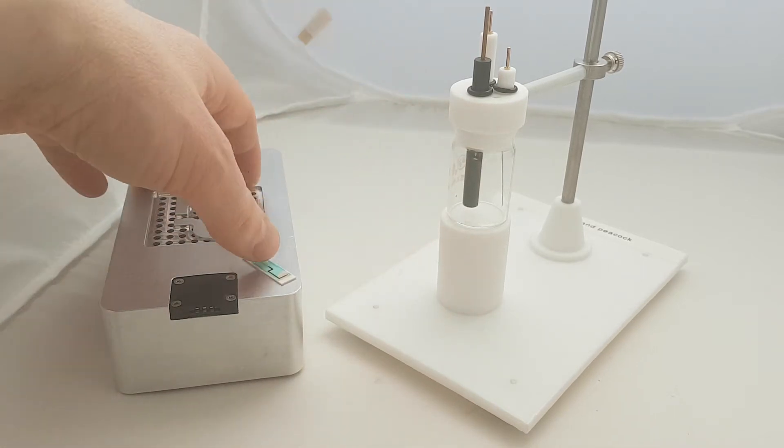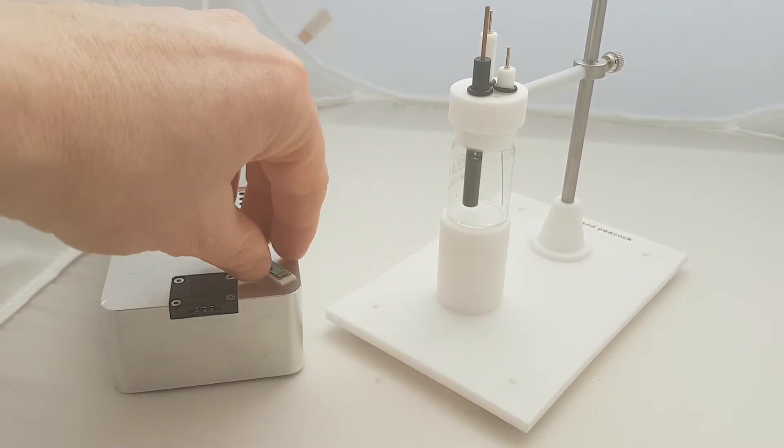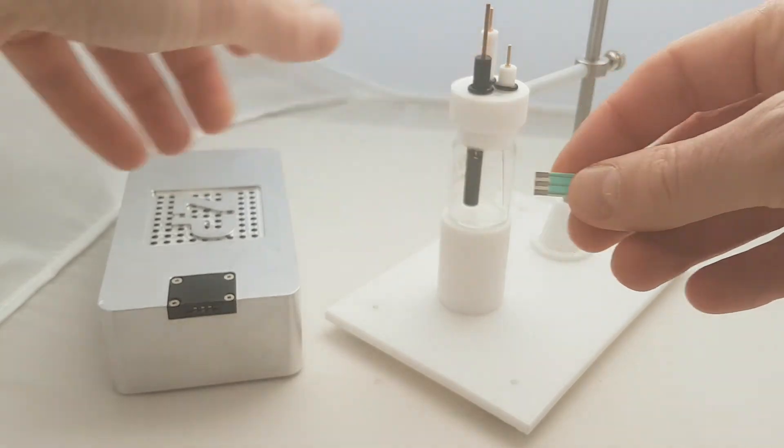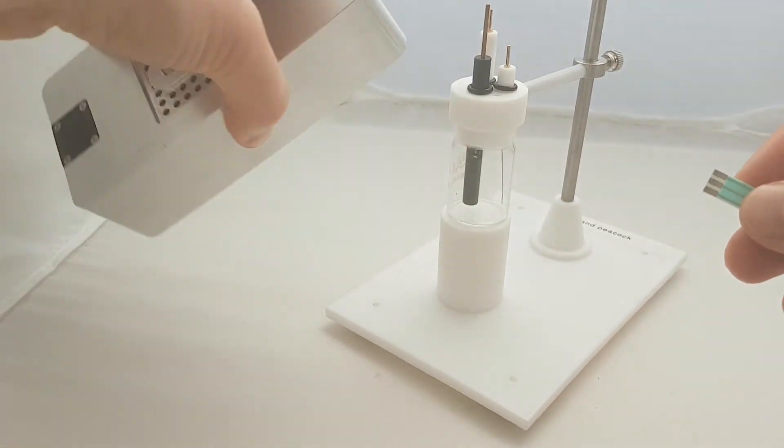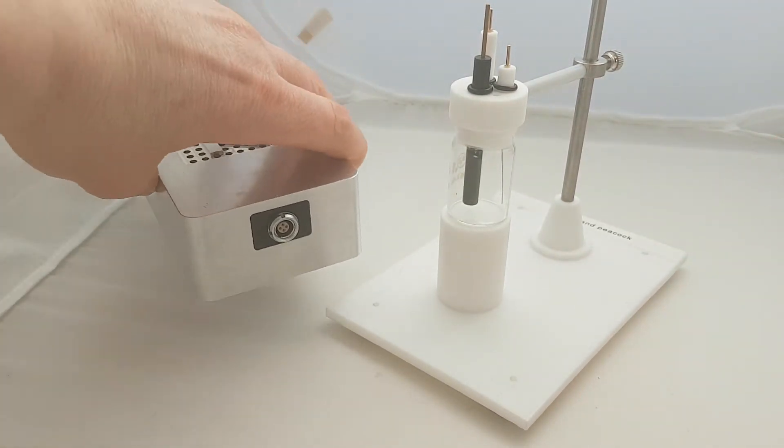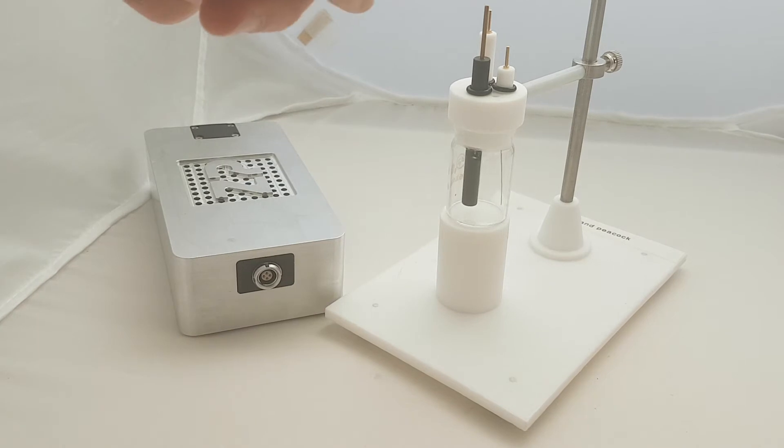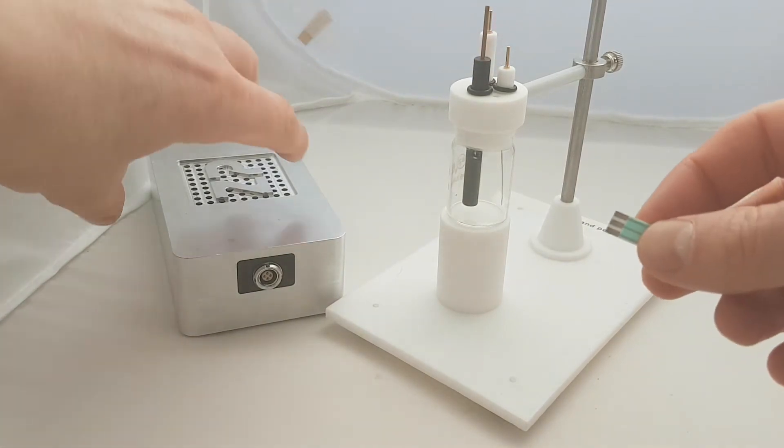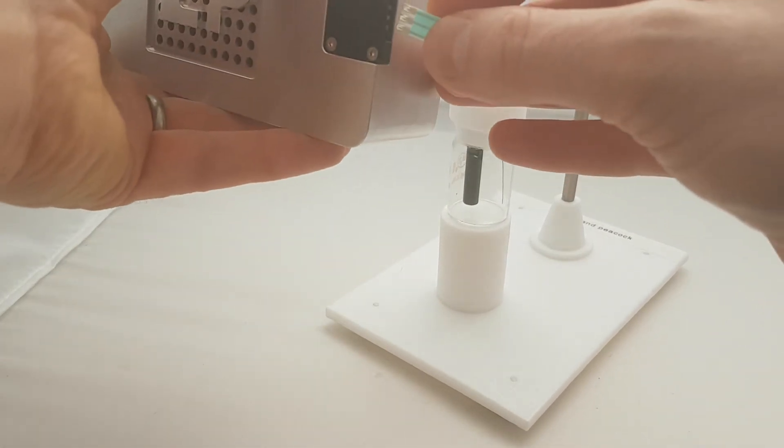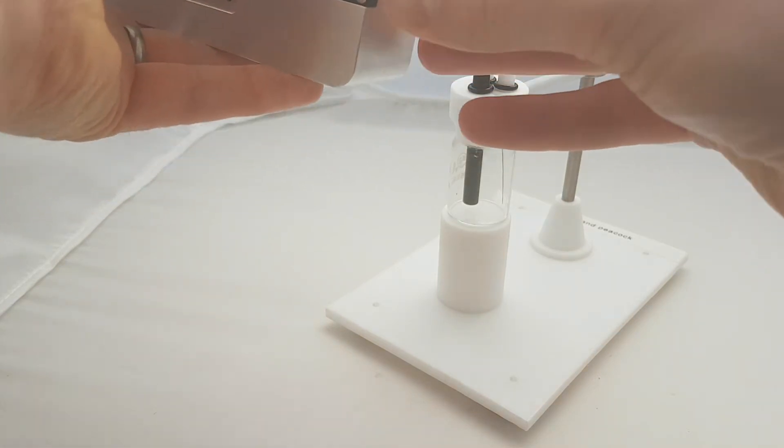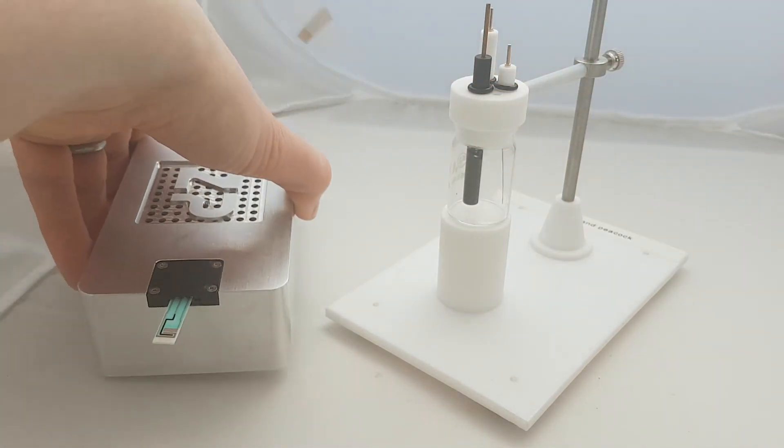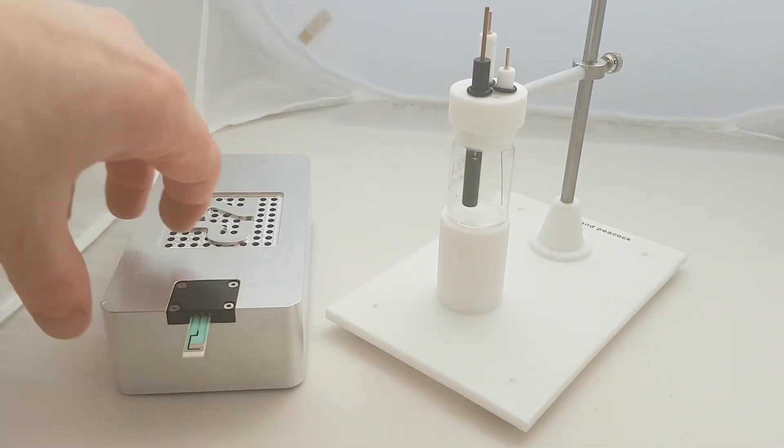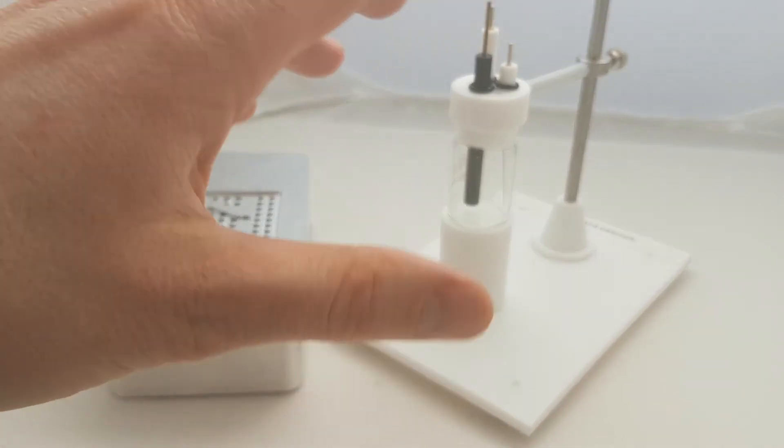You can just easily put your solutions into there and analyze them and they'll work on the anapot as well. That anapot cable connects the two and that connects the instrument to the analytical electrodes. And then if that's all successful it makes it that much easier to then start running a configuration where we just do away with all of that and start going towards a disposable setup like this.